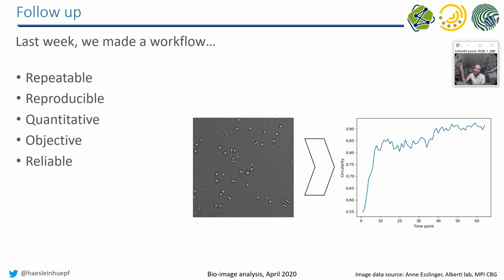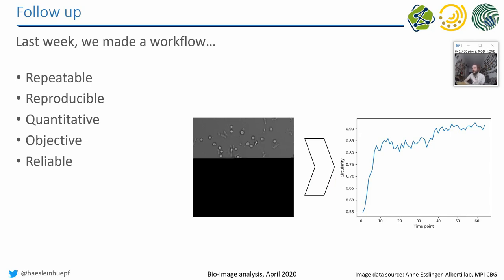Is it repeatable? Can we do this experiment again? Yeah, sure. We can just execute the script again and it will turn out that the results are the same and the data is not damaged or harmed. So we can repeat this experiment as often as we want.